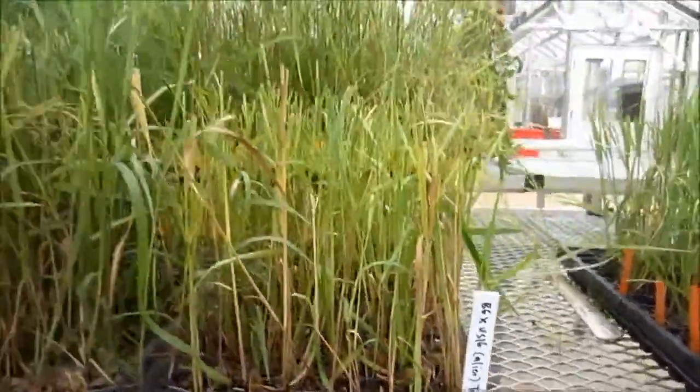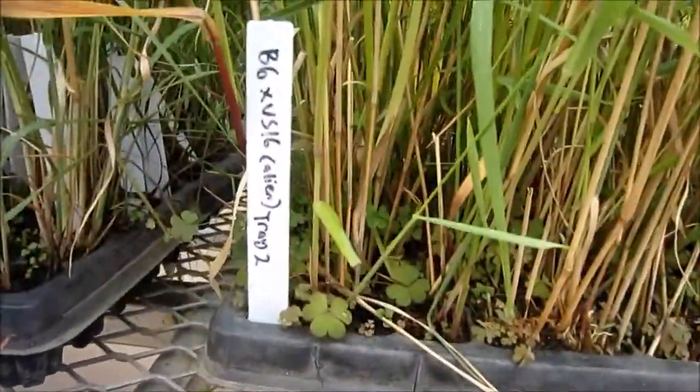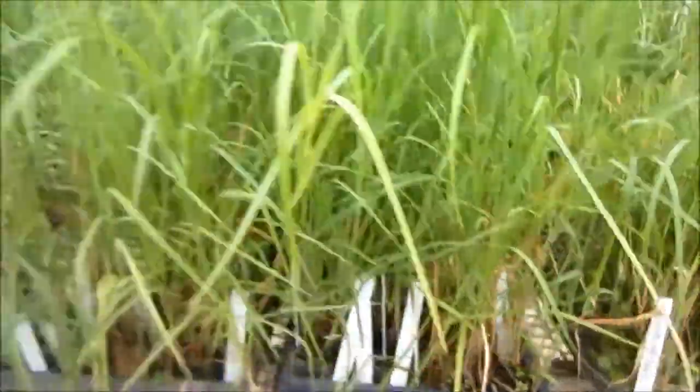To ensure that the progenies are hybrids and not self-progenies, screenings are done using SSR markers.